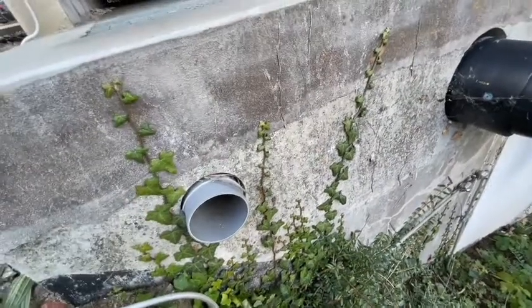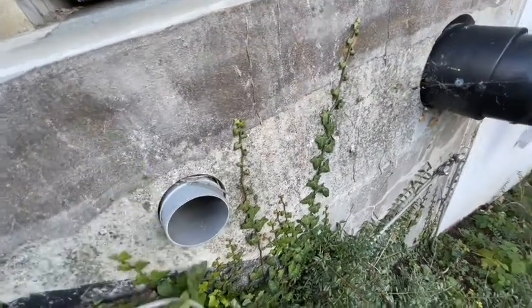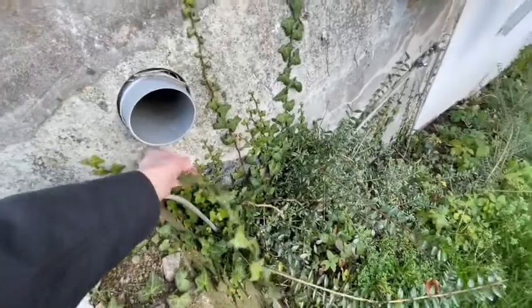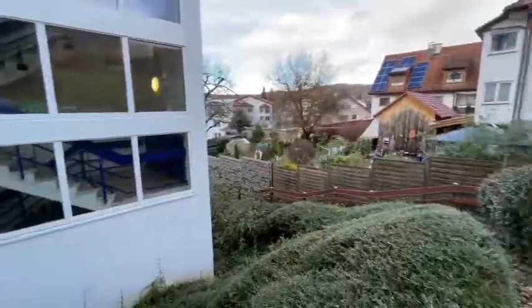Now, I usually get ivy leaves for this experiment because there's big branches of it that you can pick off and bring into the classroom. So I'll usually get big old branches, as many as I can, and bring those in. Sometimes I'll walk out to the forest and go to a tree. Other times, if I just need a little amount, they're growing right here along the side of BFA. Ivy is also still green in the wintertime, so it's a year-round leaf supply that I can get at any time in the year.